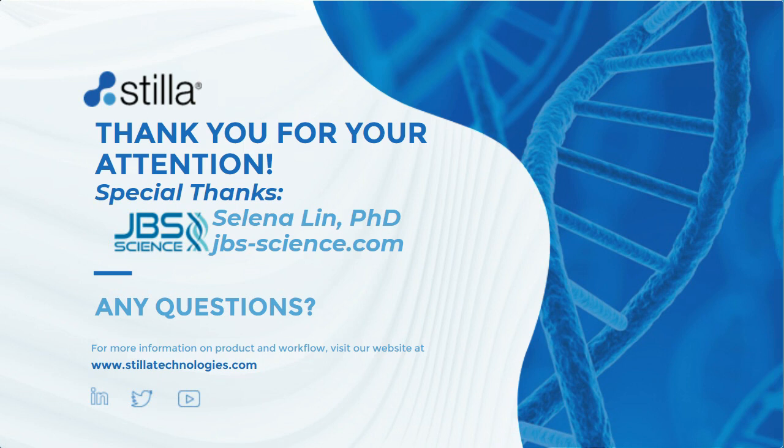That's a good question. We try to update that tool on a regular basis and keep as many of the newer instruments listed on there. If you do run across an instrument that maybe is a little bit older or just released and it's not on the tool, please feel free to reach out to the application support group or myself, and we would be happy to help you select the appropriate dyes for your instrument.